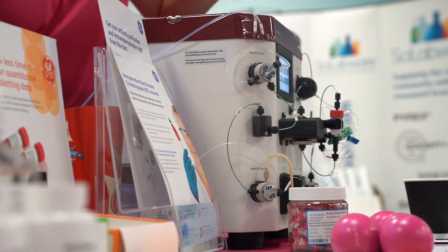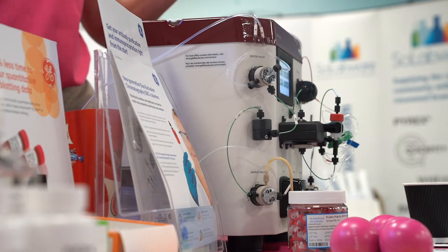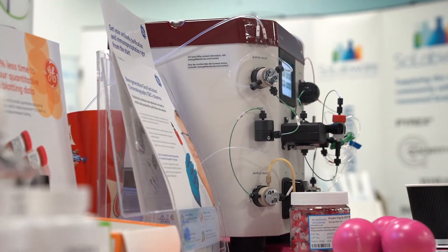I also want to talk about our MAB Select Prisma Resin. This is a new resin that we released last year.